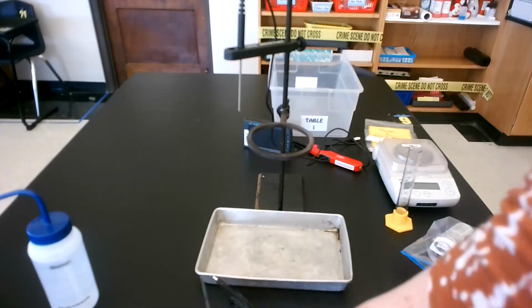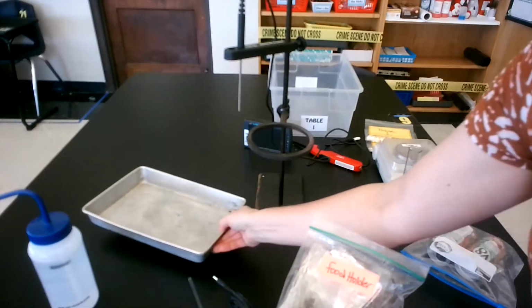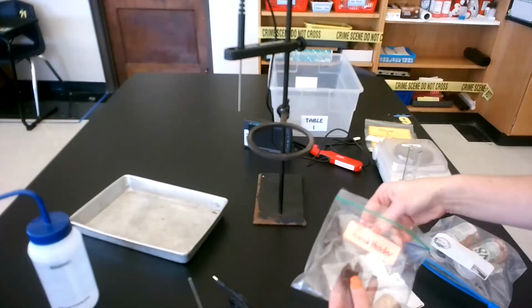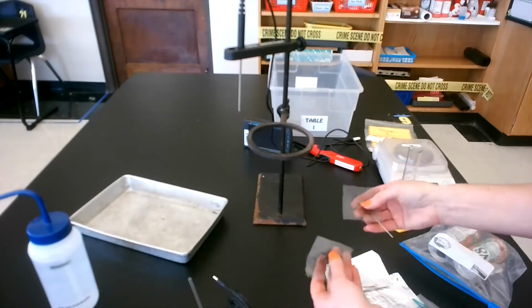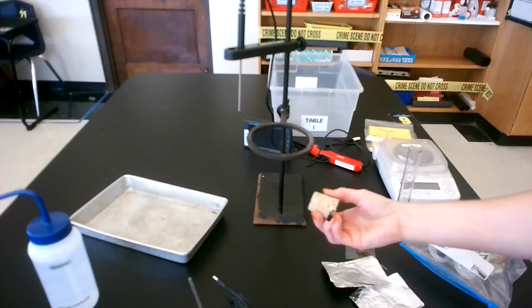So let me construct our food holder first. Let me move this tray out of the way. So we have 2 pieces of foil, the 2 metal screens with a paper clip that's been bent and stapled on, and then we have 1 natural cork.